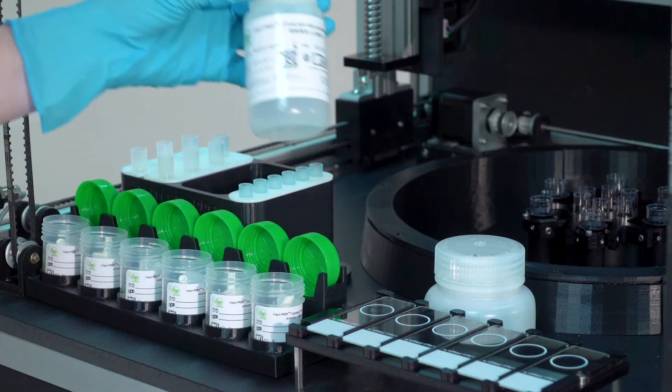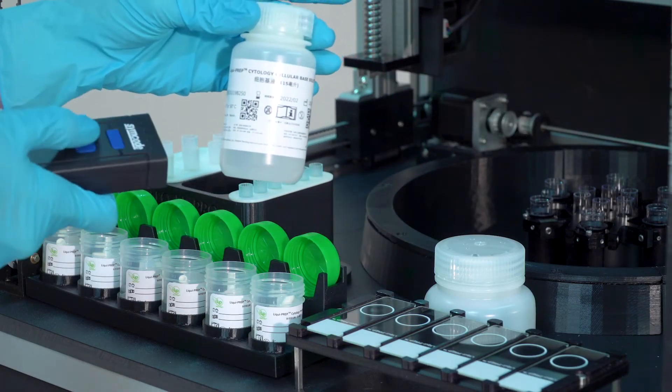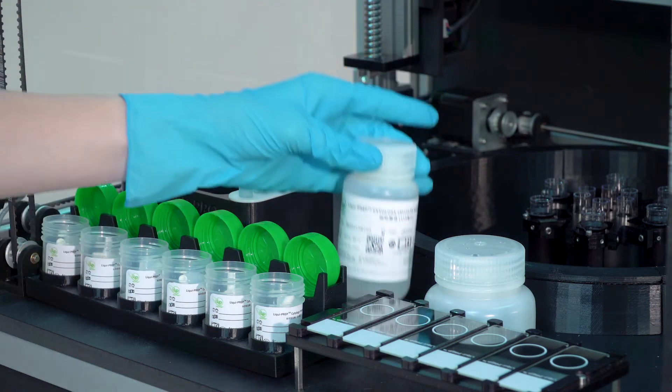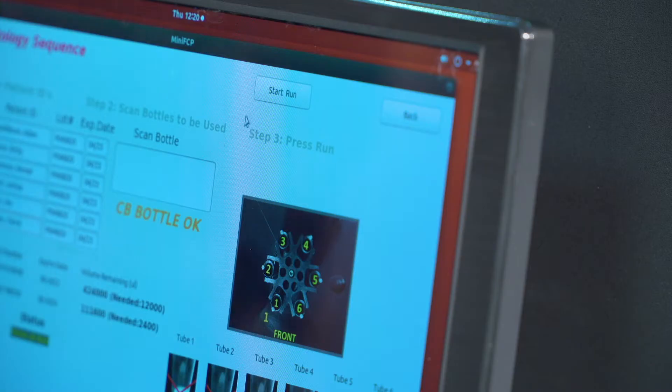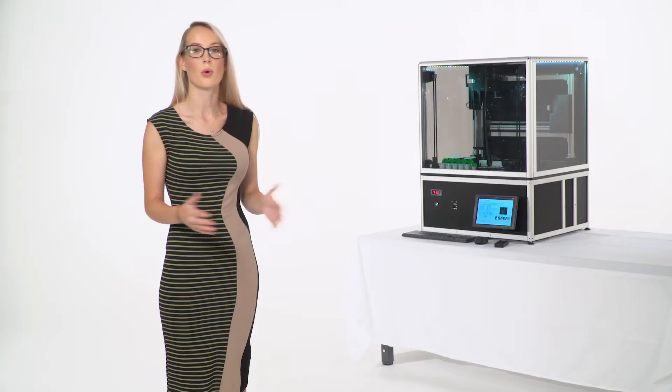Scan the LIQUIPREP reagents using the barcode scanner, then place the reagent bottles into the AutoLP Pro. Input the specimen information into the system, then start the processing run and walk away.